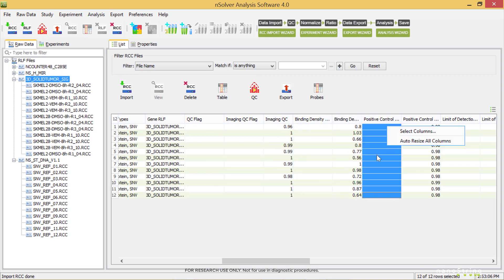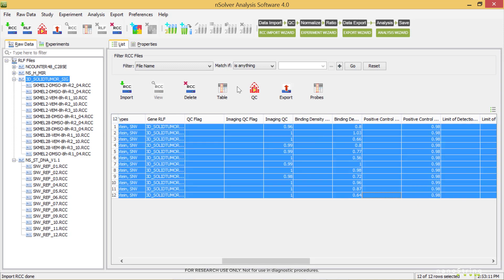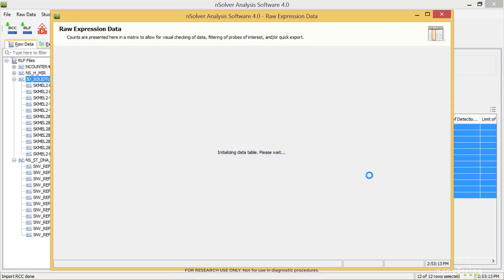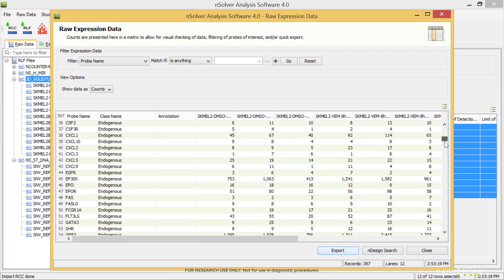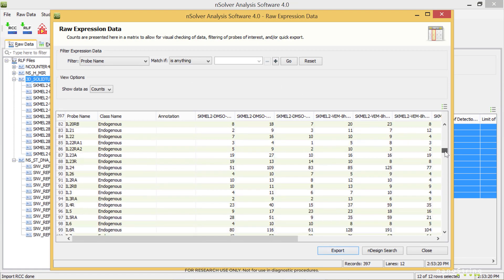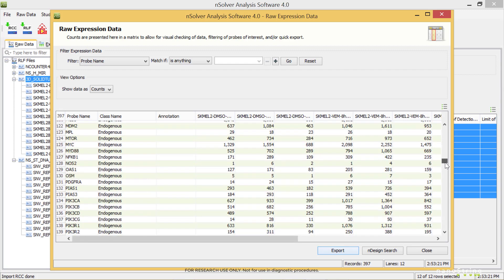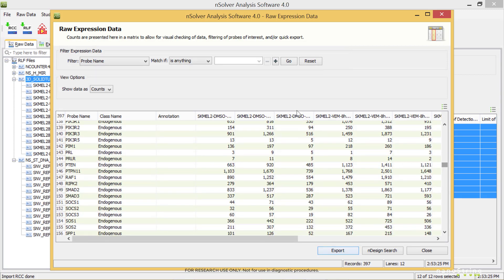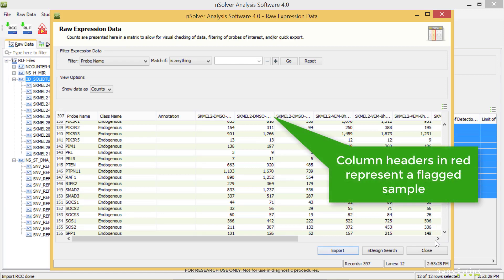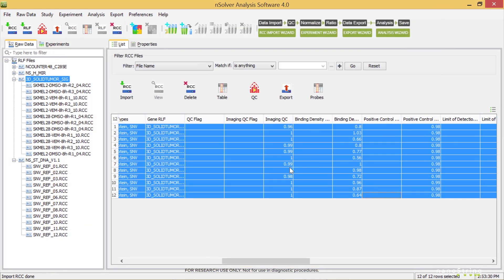One simple way to check your data is to highlight all samples and select the Table button. We can scroll through the results from different probes, observe the result from our controls under the Class Name column, and we can use this Filter Expression Data tool above the table to search for certain groups or types of probes. Column headers in red represent flagged samples.